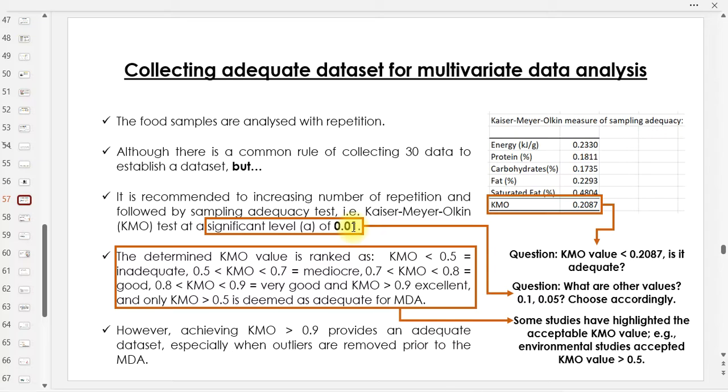This is from the statistical analysis we learned in undergrad. When we have 0.01, that indicates we allow 1% error in our study. Why do I choose 0.01 for halal? Because I want my result to be correct at 99%. Halal kot. You jumpa je cosine, definitely dia terus haram. Dia tak adanya, alah cosine tu 1%.